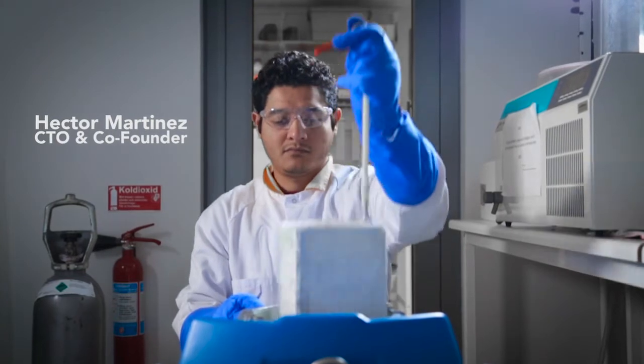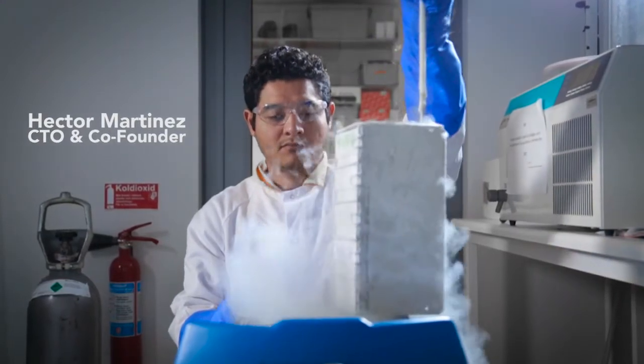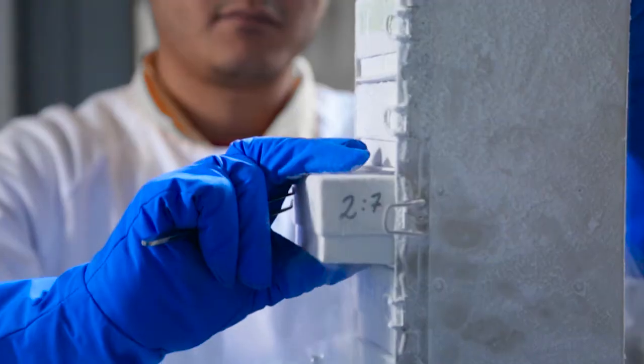Previously, the market has been restricted to those who can afford expensive 3D bioprinters, and the technical expertise for using this has been very high.